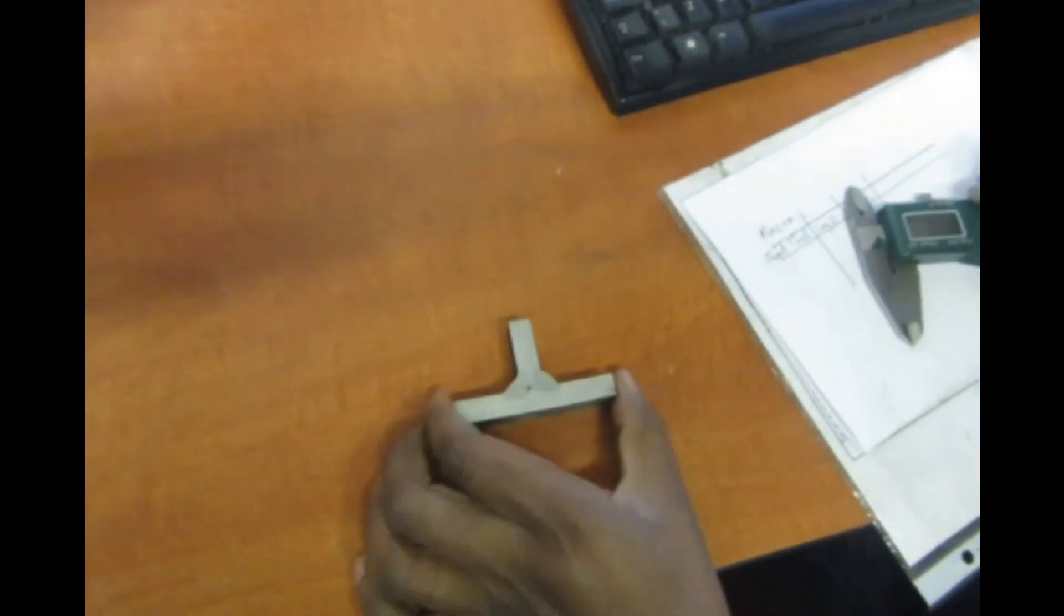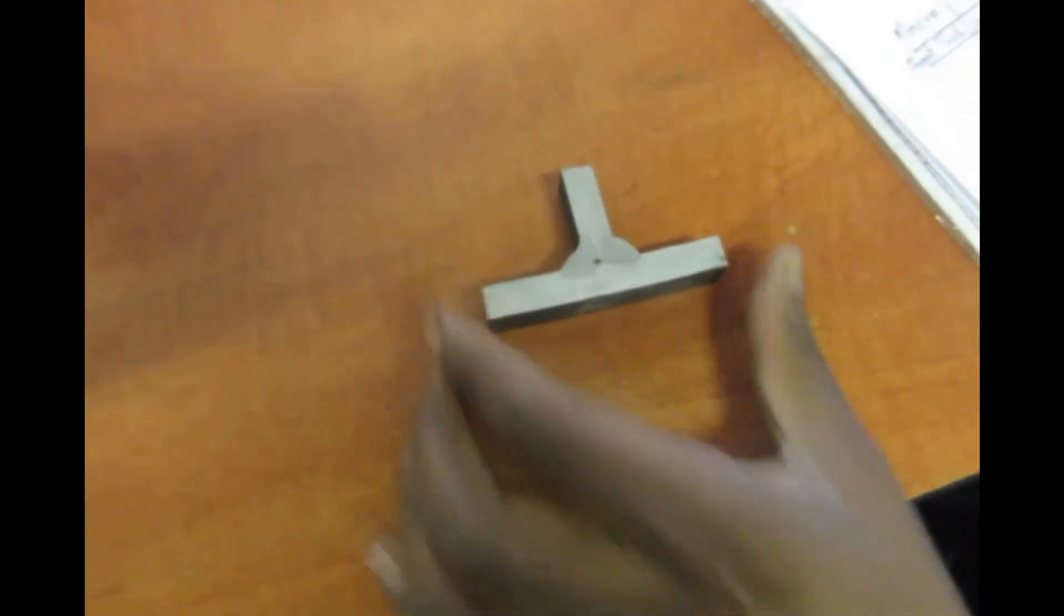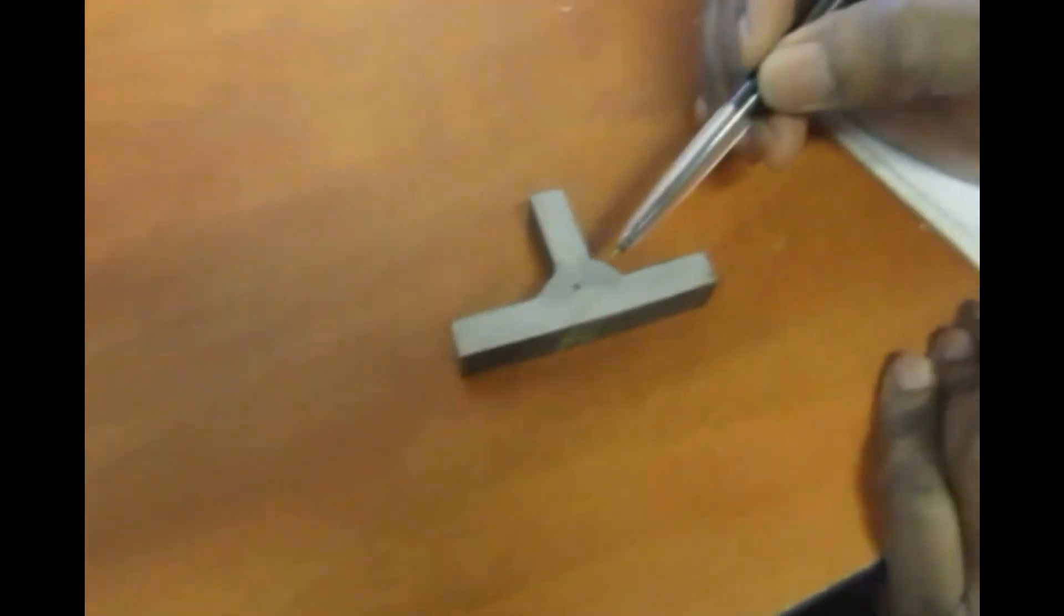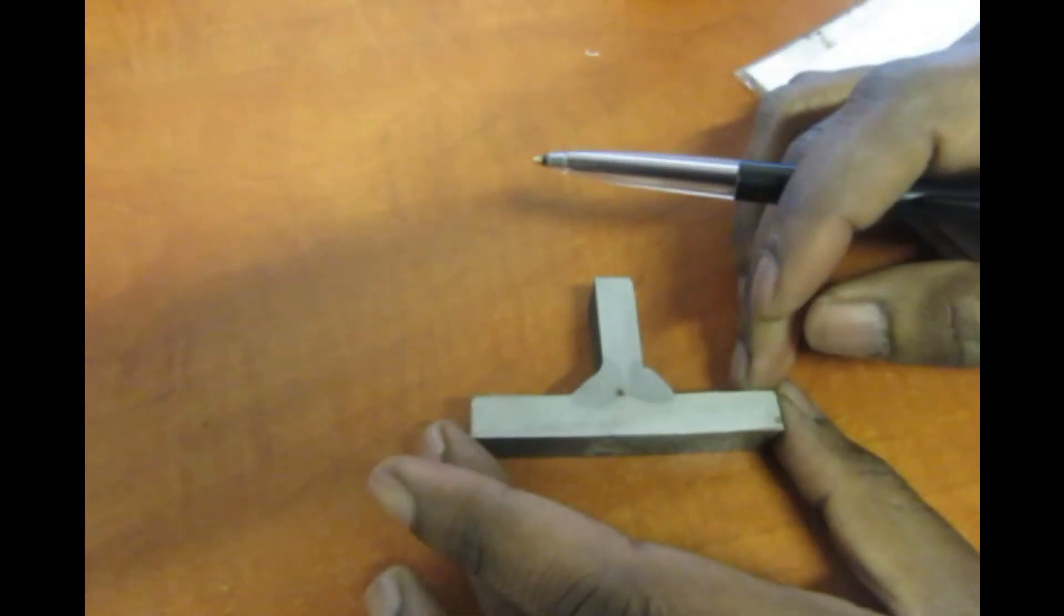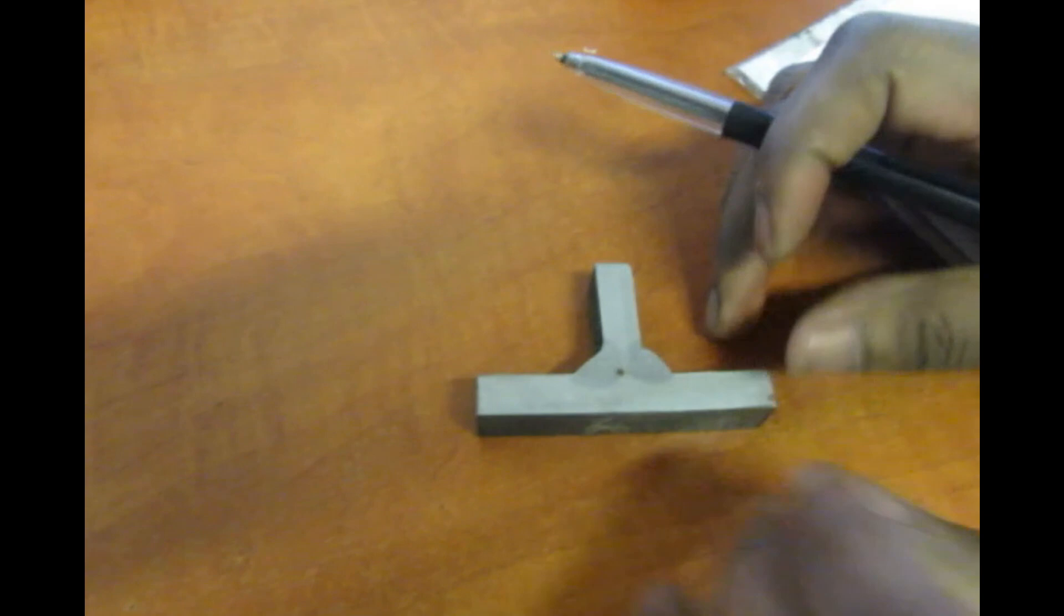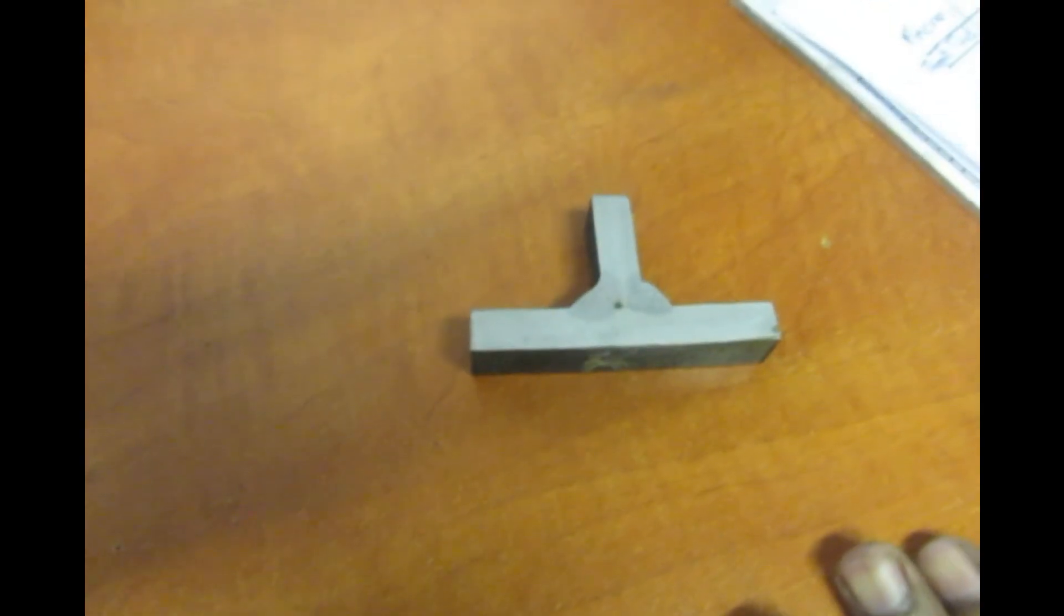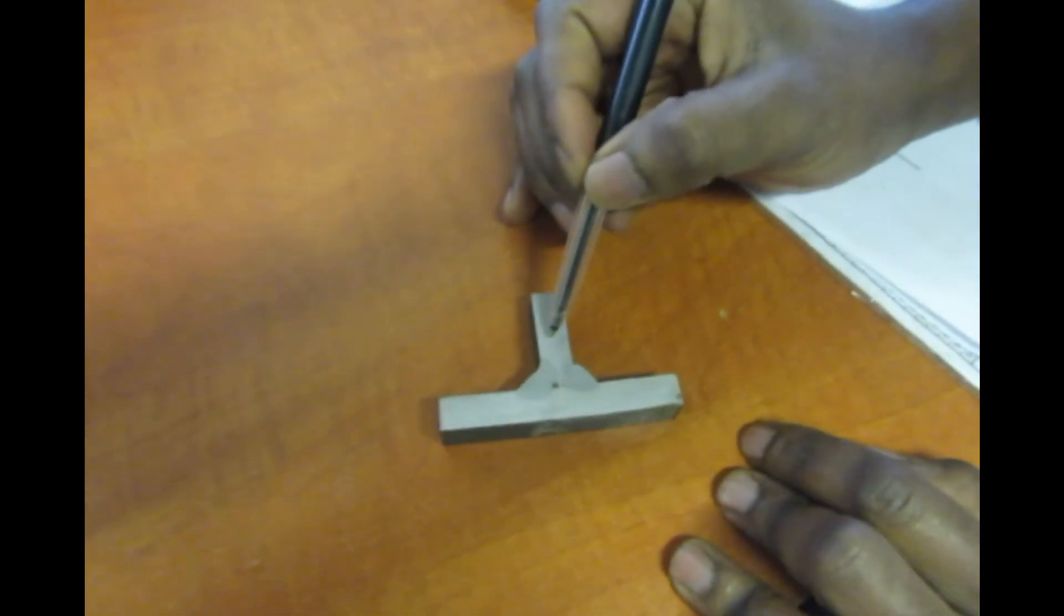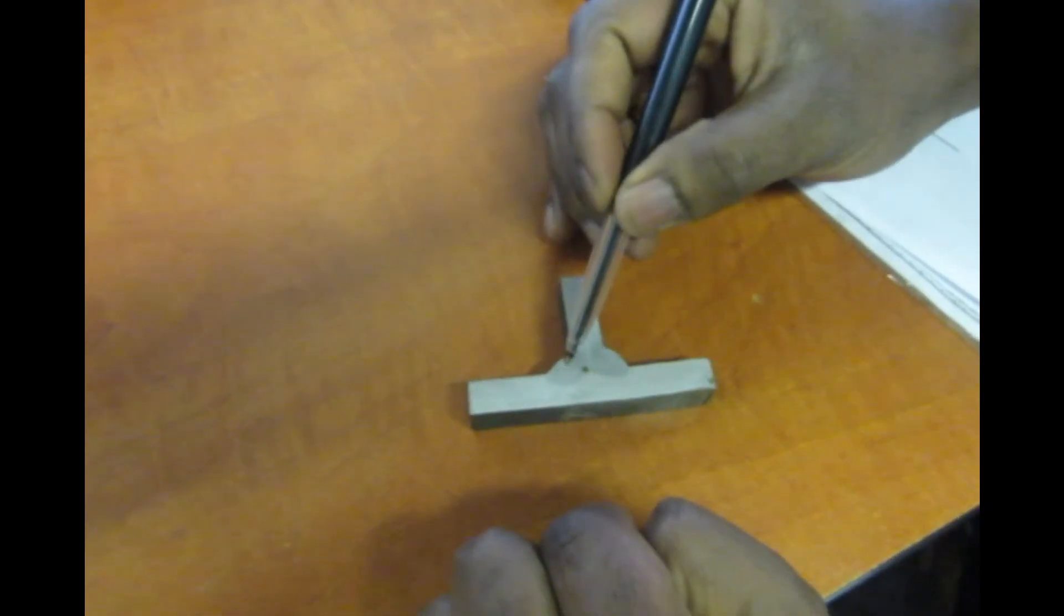Earlier I was explaining how to etch a macro. This is a macro with two welds. Now I want to do my process examination. What I'm trying to do is check if there is full penetration or full fusion between the parent metal and the weld. I'm going to draw a line there, as straight as possible.